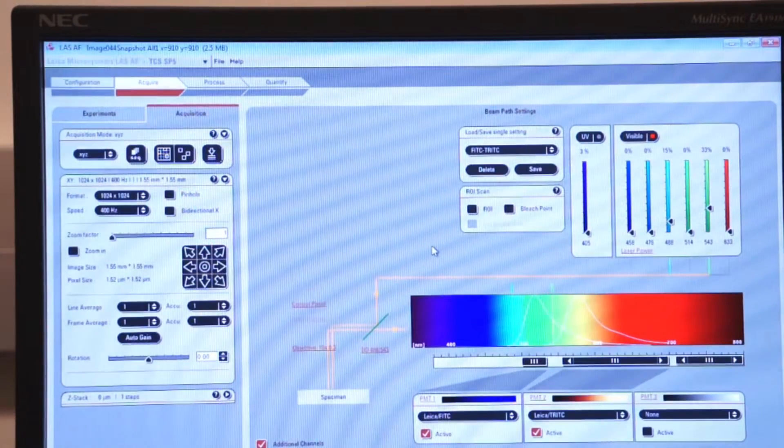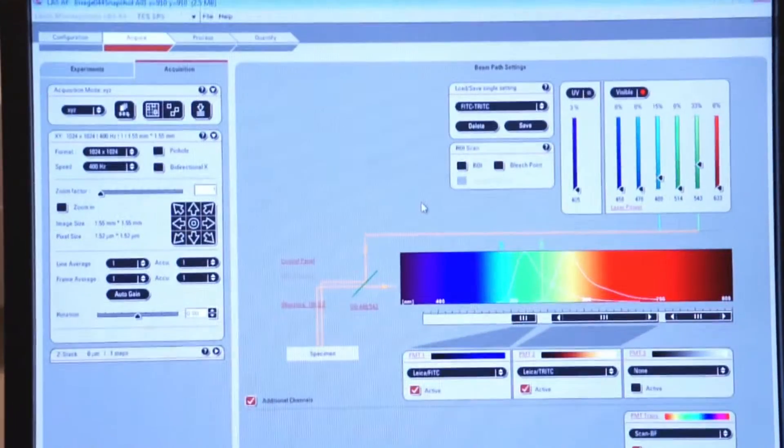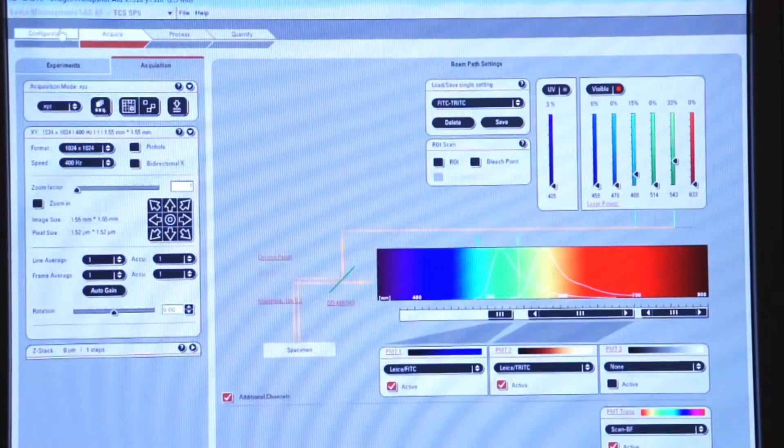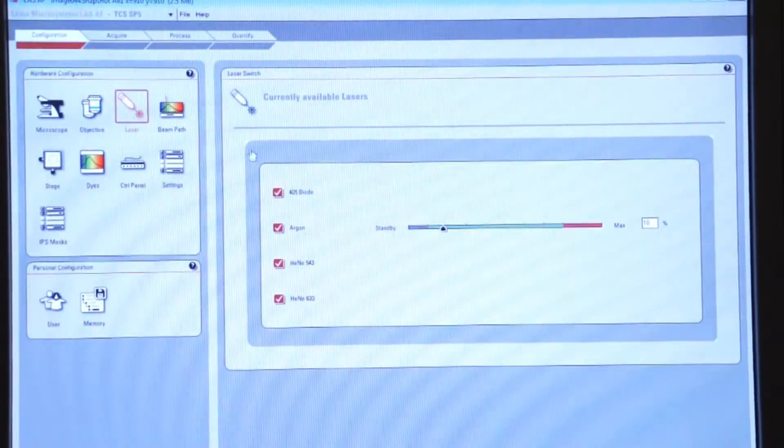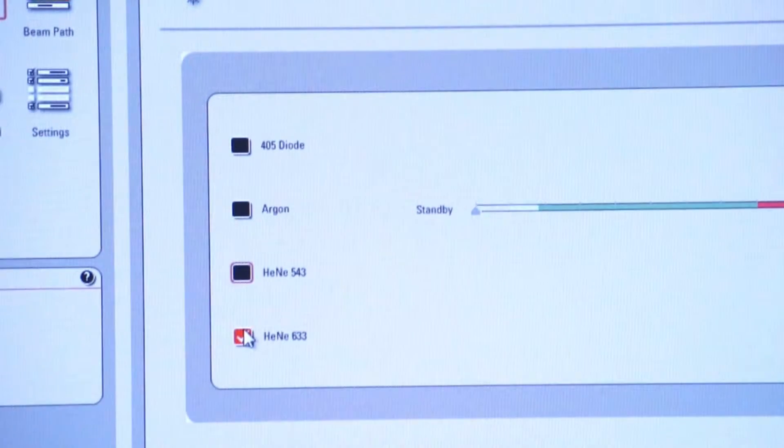Now, let's talk about shutdown of the entire system. Now that we've completed our session for the day, we want to shut down the software and the system in a proper fashion. To do that, we go back to our configuration tab and we turn off each of the lasers that are on the configuration menu.